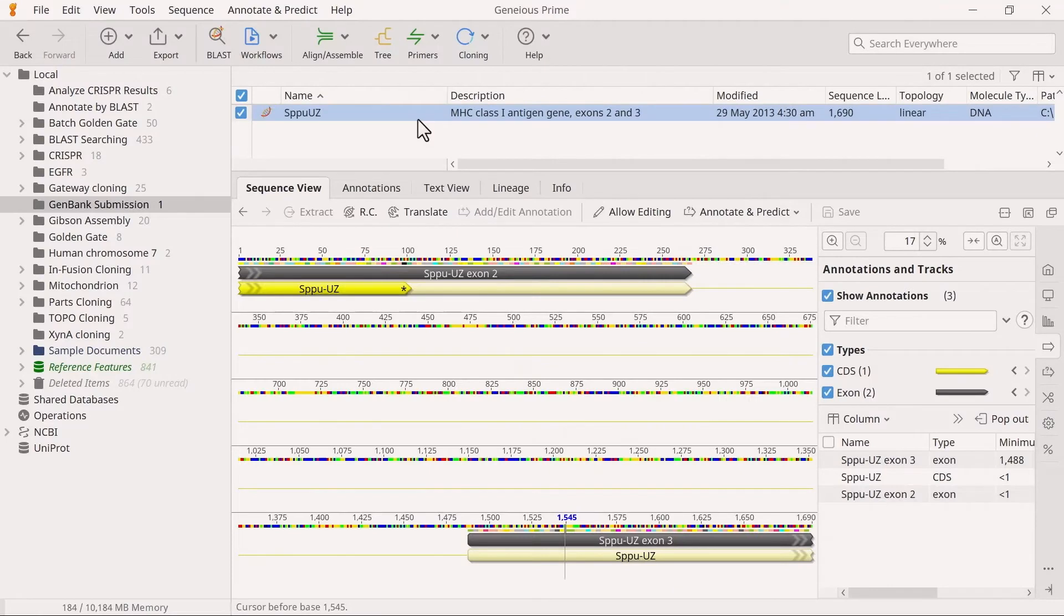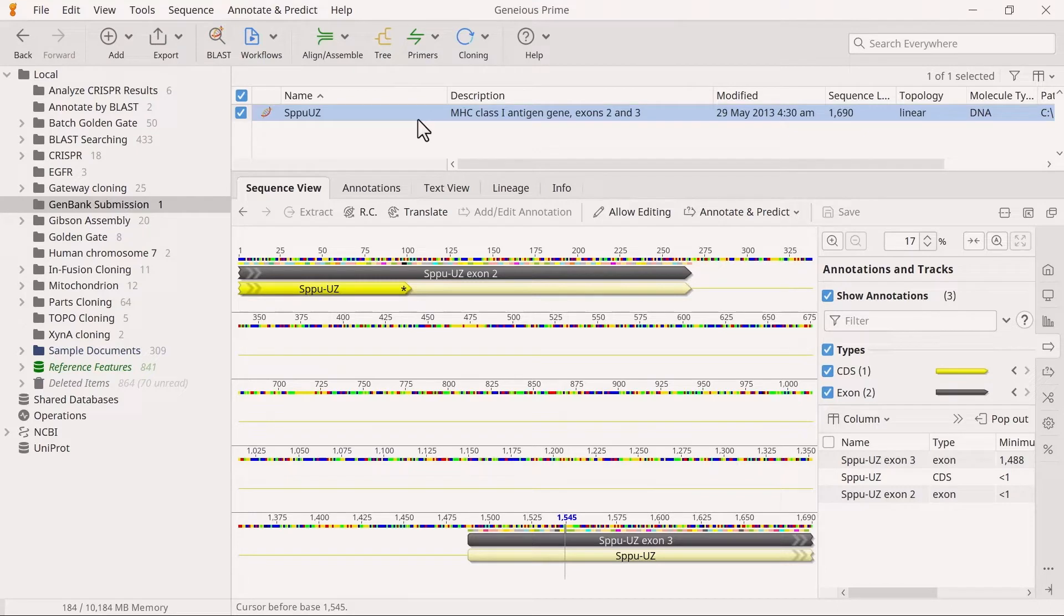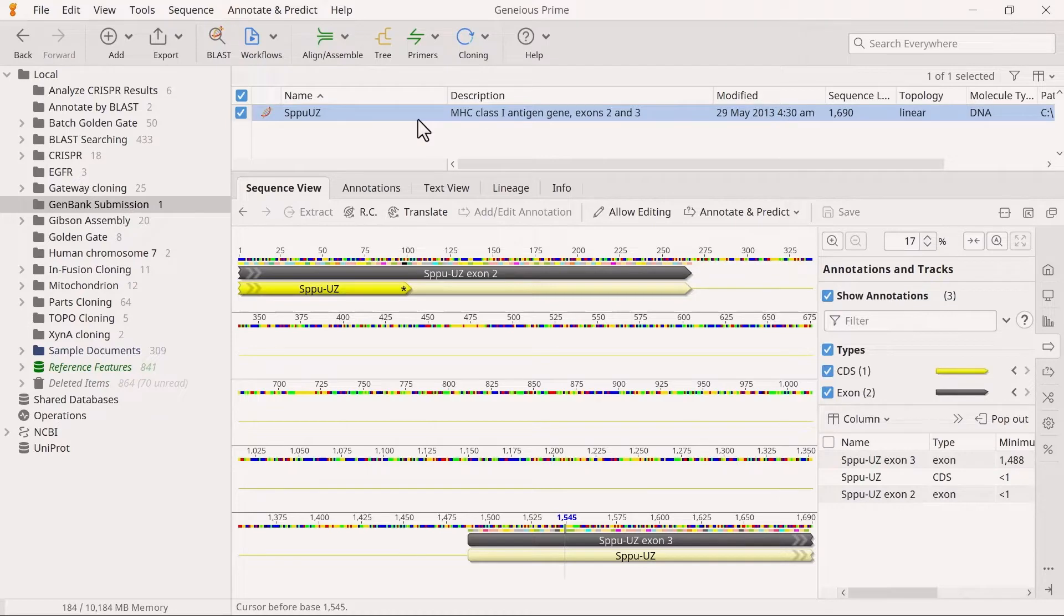The first step involves adding general information about the sequence, including a description, source organism, tissue type, geographic location, sampling dates, etc. All GenBank submissions require this information.